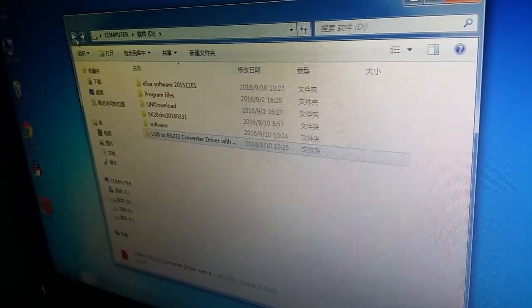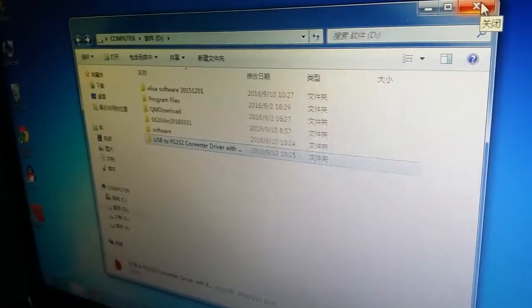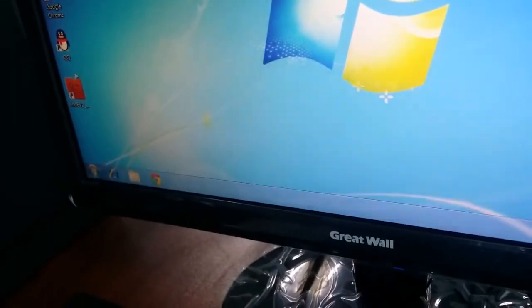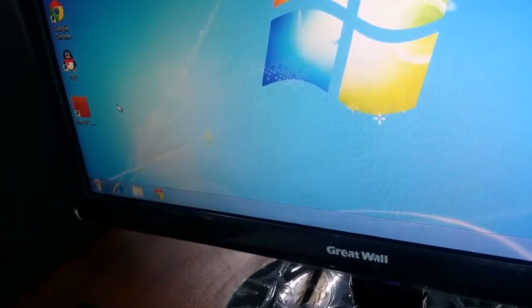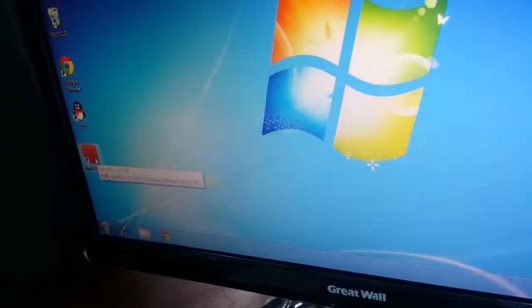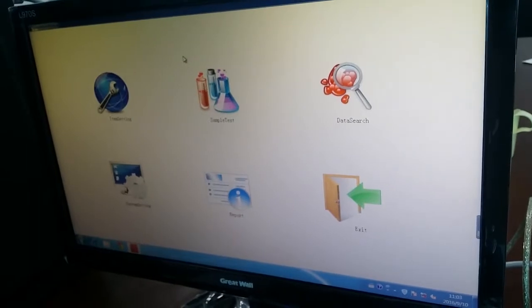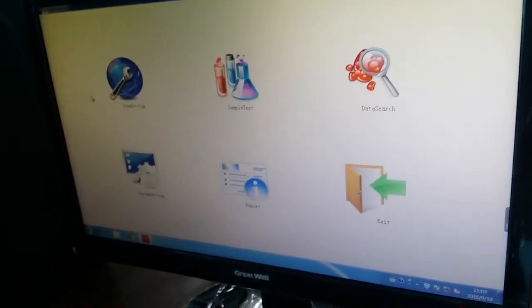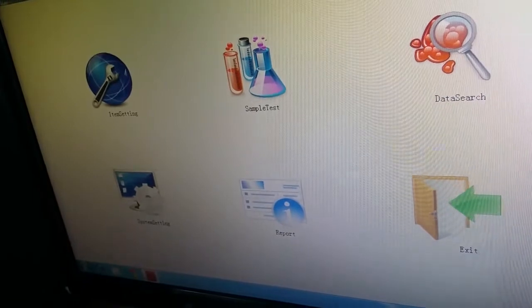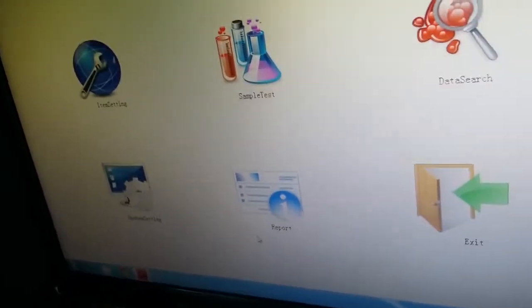After setting up the software, let me show you how to test with our machine. After you install the software, you can find the software shortcut on the desktop. Double-click it to launch. You will get the interface and hear a noise from the machine, because our machine performs a self-check automatically. After waiting about five seconds, you will get the main interface showing: item setting, sample test, data, search, system set, report, and exit.